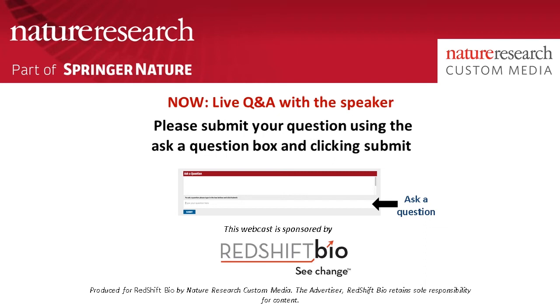Our next question asks, what characterization tools can be used to assess toxicity of oligomers and fibrils? To assess the toxicity, the most common assay people use, and one that we employ as well, is to look at cell viability when you have toxic preparations applied to different cell types.